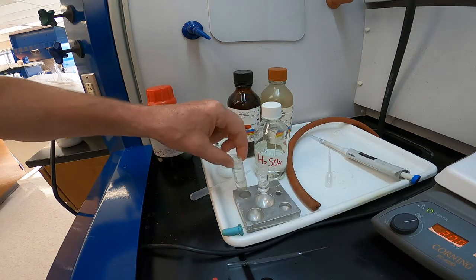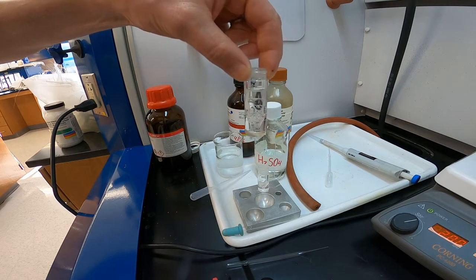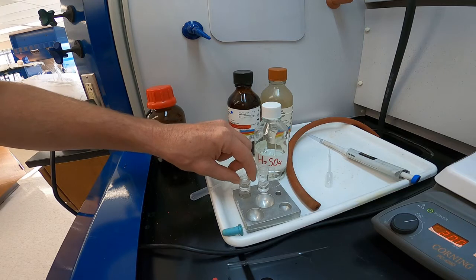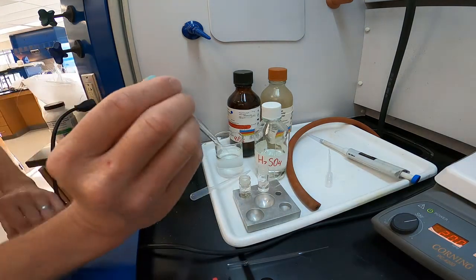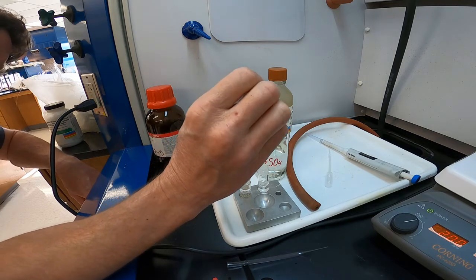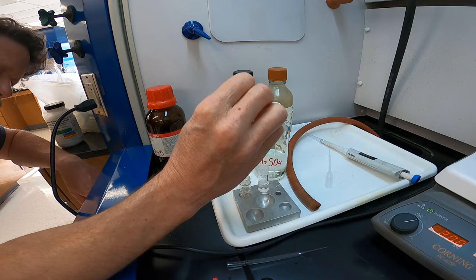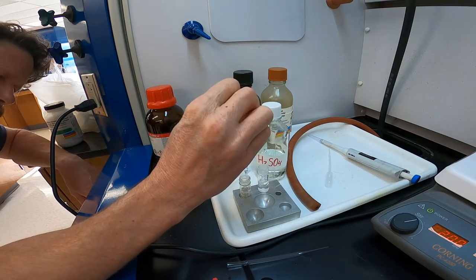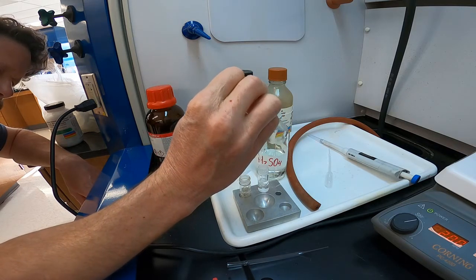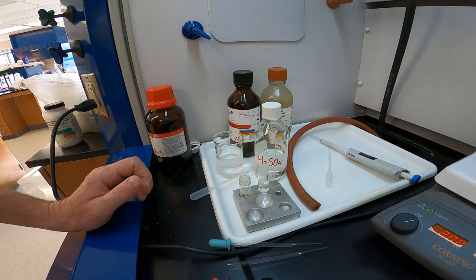And if you look very carefully, it's hard to see for sure in here, but there's actually two layers. We have an aqueous layer, and then we also have the organic layer on top with the ether and our product. So what I'm going to do is just carefully remove just the organic layer. And it's okay if you get a little water in there, we'll dry it during the distillation setup. So there's our non-purified product. To purify the product, I'm going to come back in a second with a different setup and I'll explain that. We're going to do a distillation to purify the product.